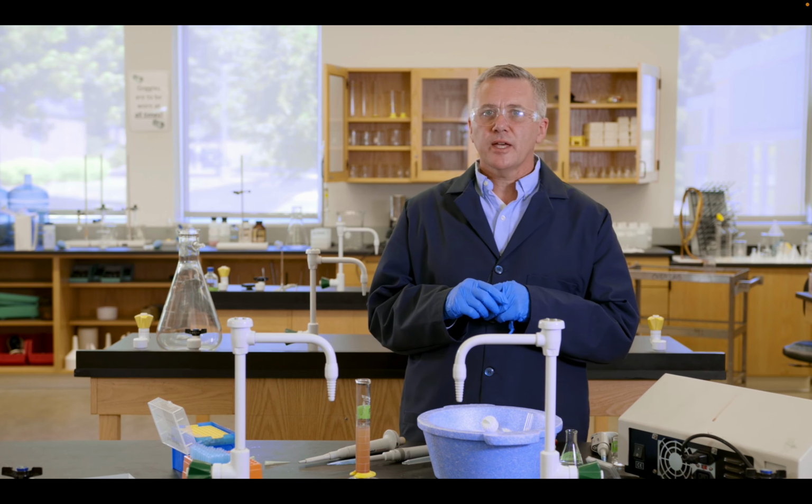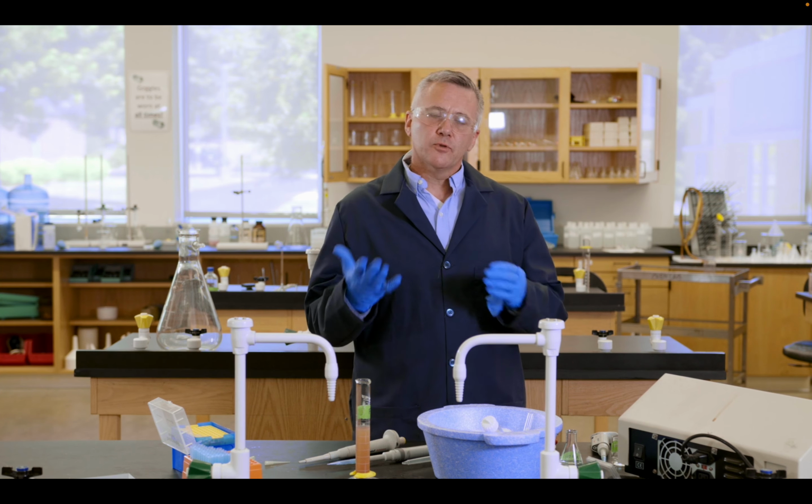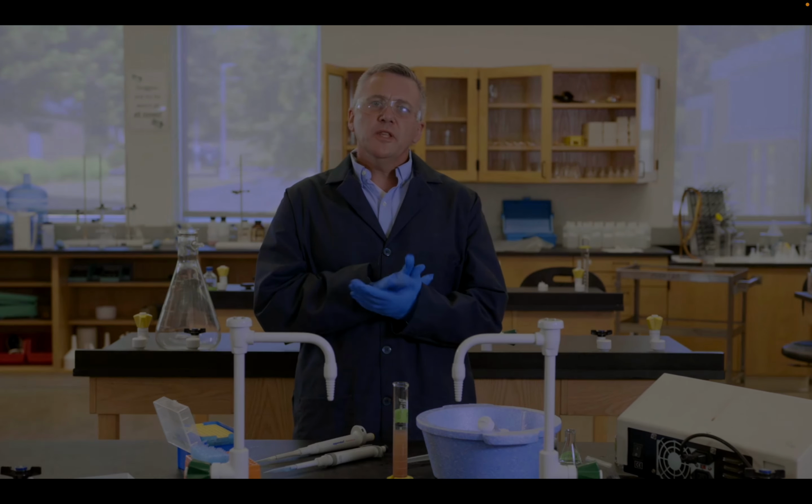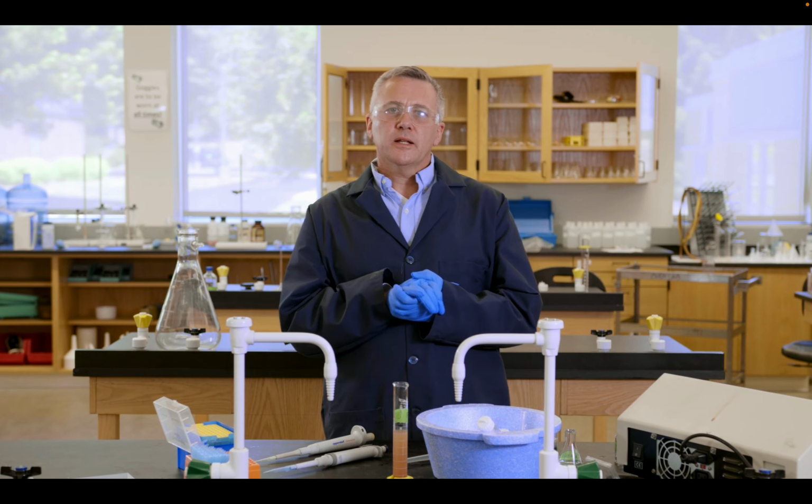We also need to check next for GDH activity. Remember that catalyzes the same reaction. But hopefully, if we're lucky, none of it's there, but it has possibility. All right, so for now, though, we've got a GOT activity. So we've done GOT activity on FR1. Next, we want to perform GDH activity on FR1.